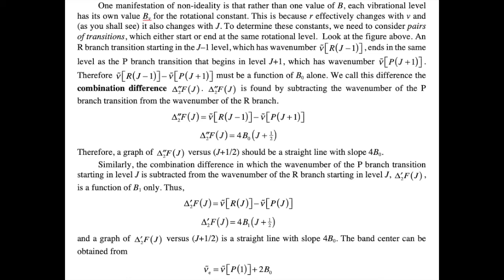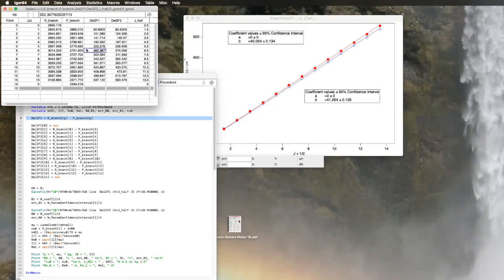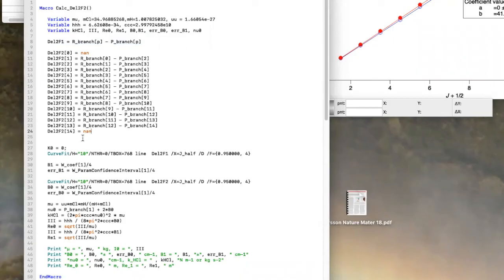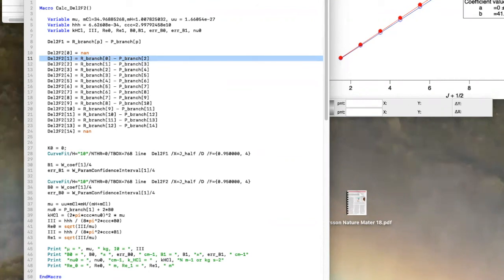For the second combination difference, I need the j-minus-one R branch value minus the j-plus-one P branch value. You could do that in a loop, but let's do it the brute-force way. When we compute the combination differences, two of them won't have a number associated with them because you don't have all the values — so we call those NaN (not a number) and they won't be used in calculations. For the rest, I put them in directly, copying and pasting and correcting the element number. For a given j, the R branch element and P branch element always differ by two.